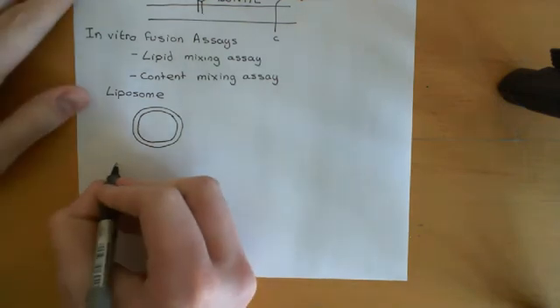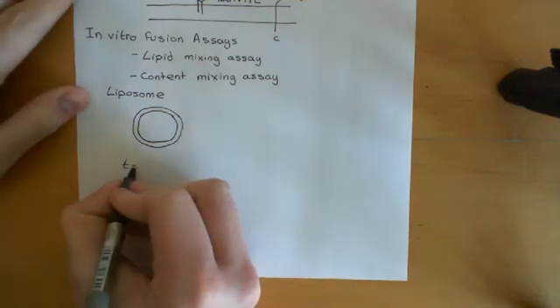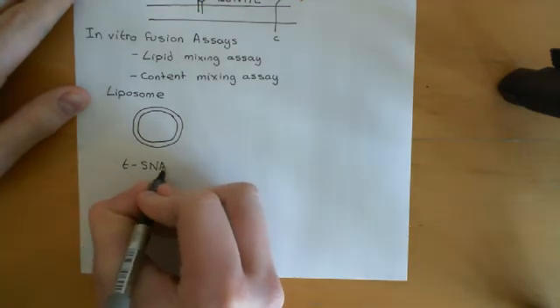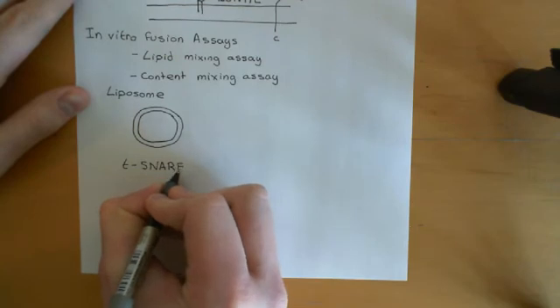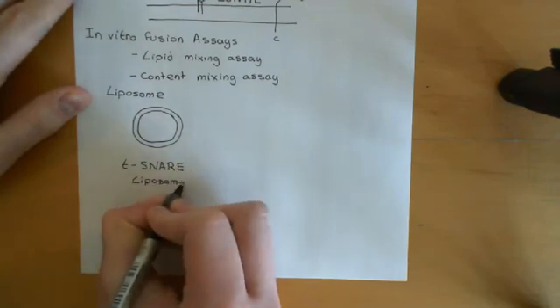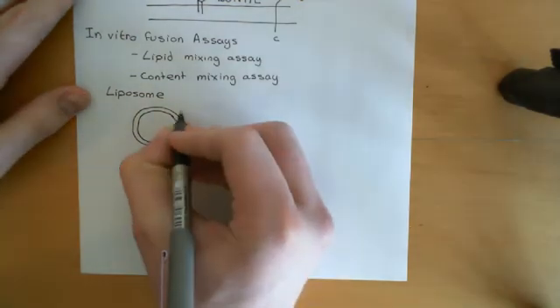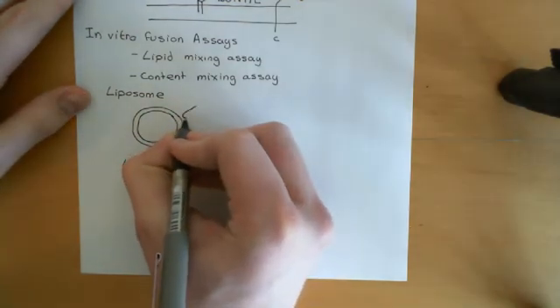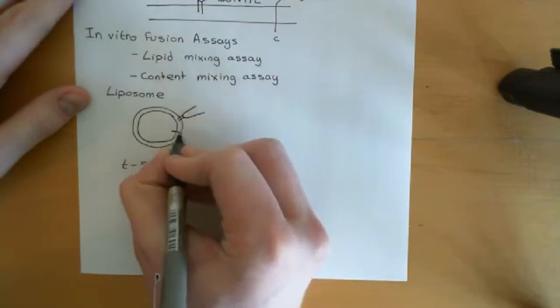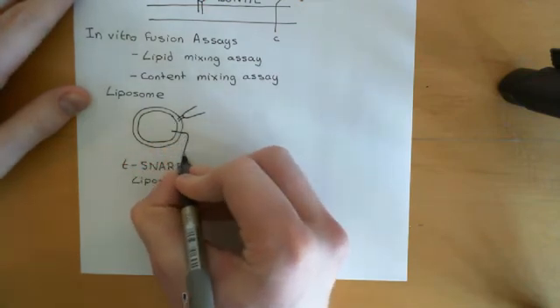In one population of liposomes, you can put in the T-SNAREs. We'll call these the T-SNARE liposomes. So the idea is you can make liposomes which will have the T-SNAREs in. So which are the T-SNAREs? Well, you'll have SNAP25, so I'll put this here, and also syntaxin 1 here as well.